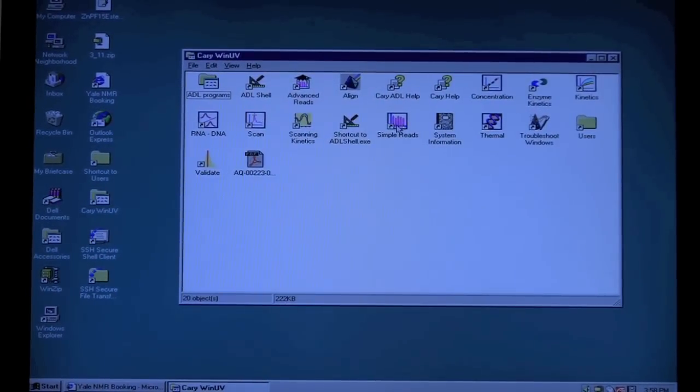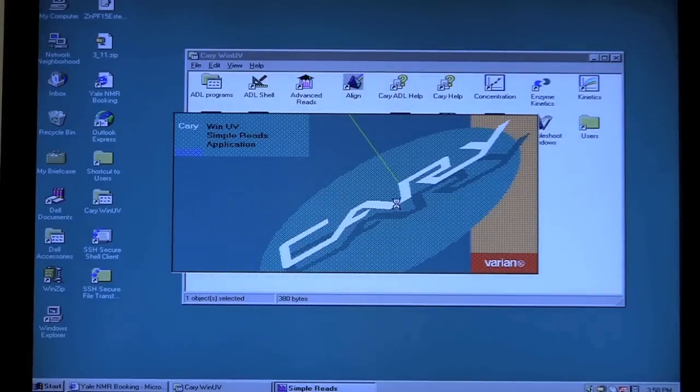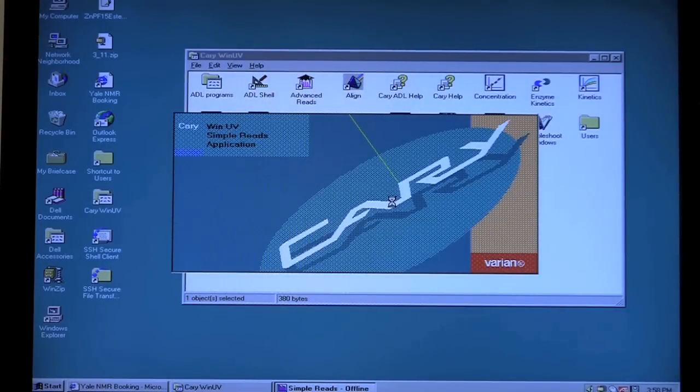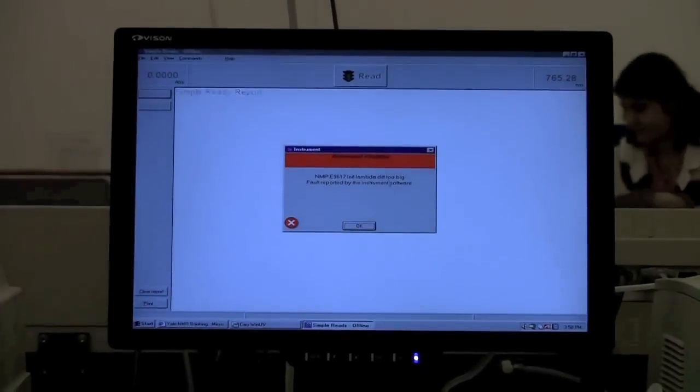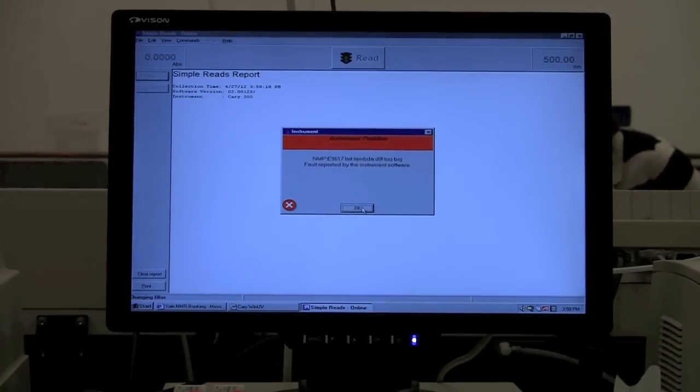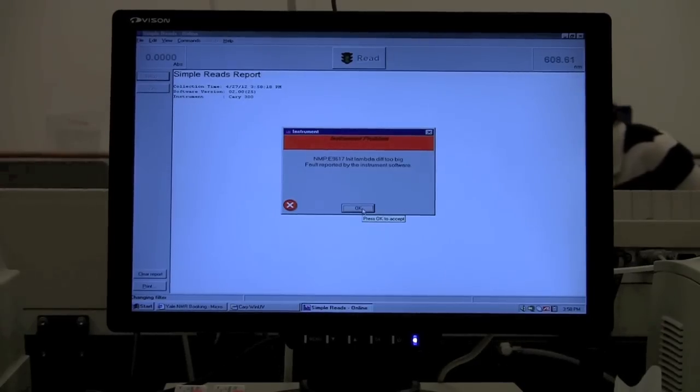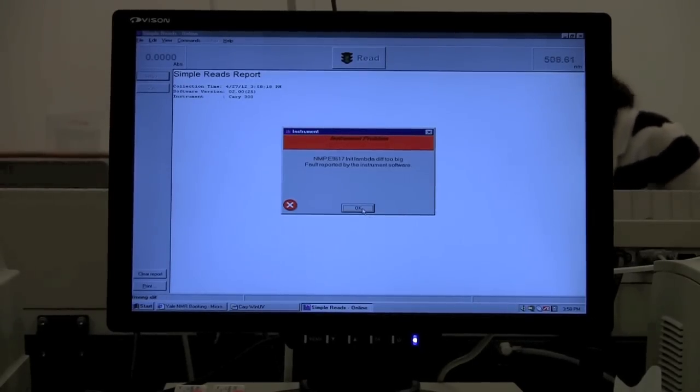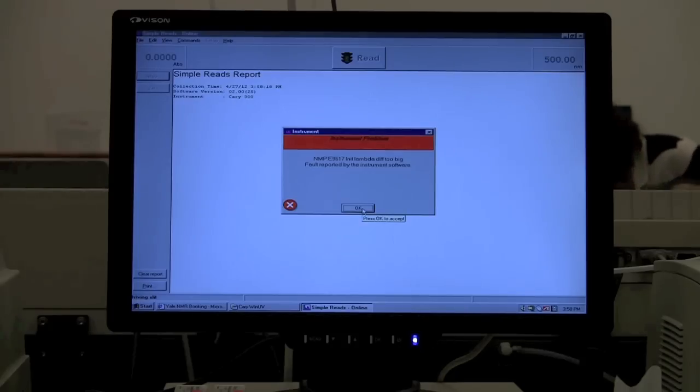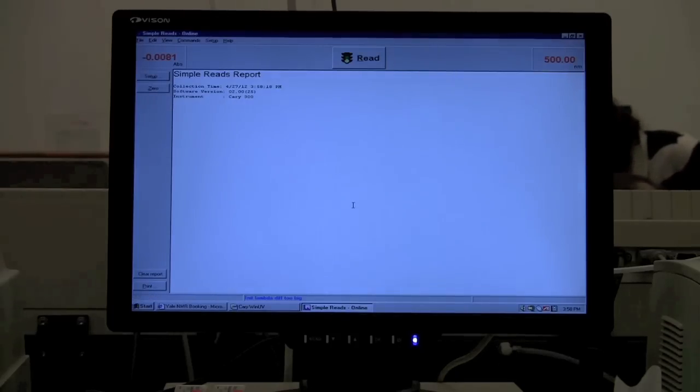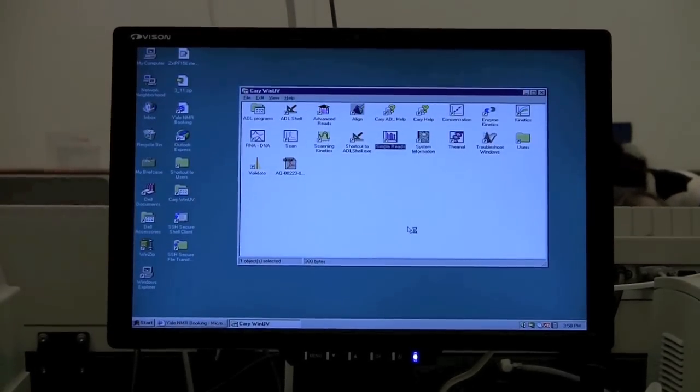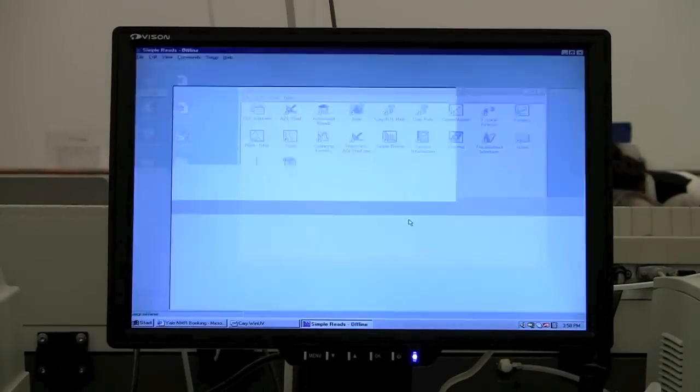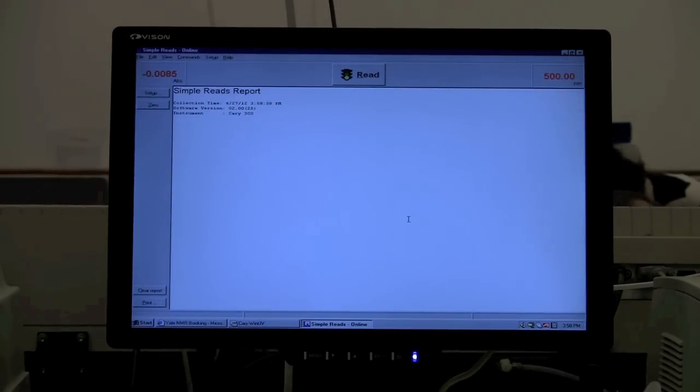What Simple Reads does is it will monitor a single wavelength at a single point in time. So if you just want to measure the absorbance at a particular wavelength, hang on, it's got to initialize. Let's restart it just to make sure that it's okay. I think that's probably because we have the integrating sphere in there. Yes, so now it's okay.